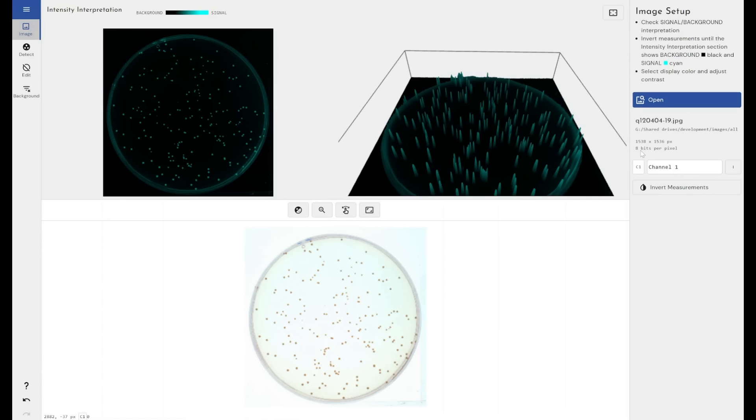So you would image your plate, your wells, whatever it may be, export the image and bring it into this software for analysis.